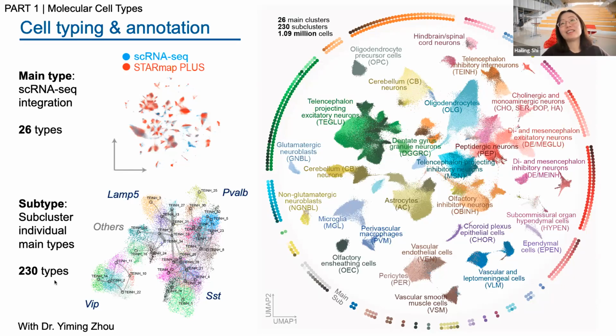Yeah, it does take a huge amount of effort to do the annotation. But I think with the help of ChatGPT, we can make it smoother. It works nicely: you give it a gene list, and it returns the function of all those genes and potentially comes up with a biologically meaningful name for that cluster.